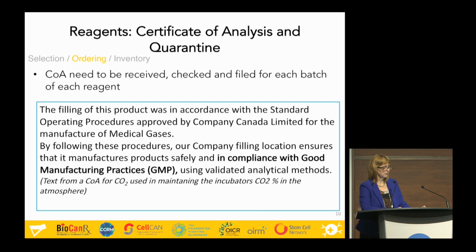Once you have all your reagents, you will order them, and you have to have certain documents coming with your reagents, like the certificates of analysis that need to be checked and filed. You cannot just put it on the side. You need to actually read it and see that all the specifications are okay, and then you file it for each reagent you receive, every time you receive it.